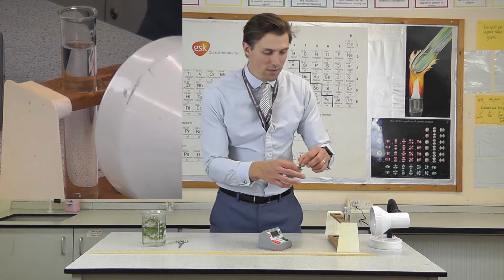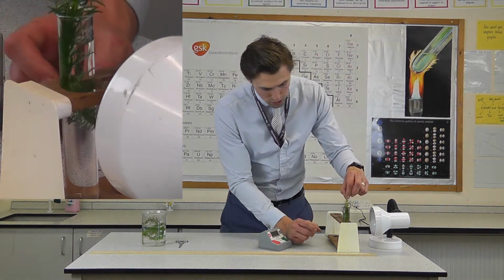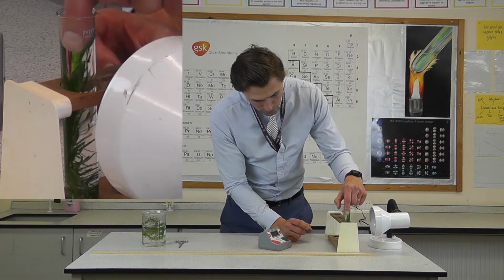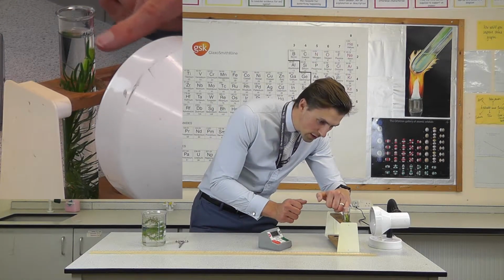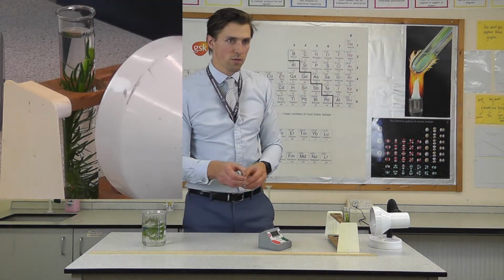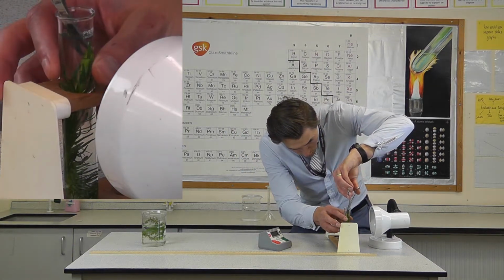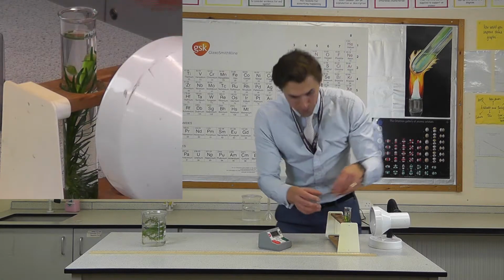And we're actually going to cut it as well. It's been freshly cut, but I'm going to cut it again. So I'm going to submerge it in here, pop it all the way down, push that in. You can see here that the top is submerged below the waterline, but I'm just going to cut that again with some sharp scissors. Okay, there we go.